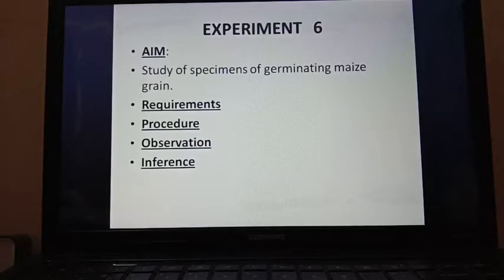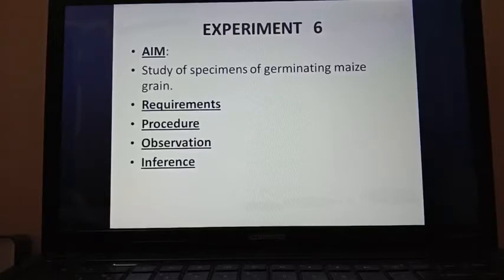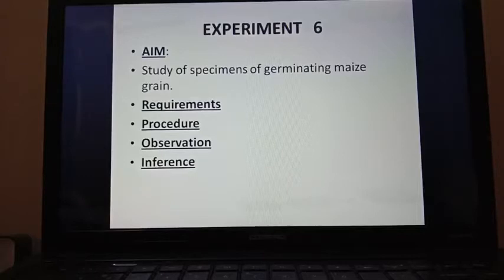First, to see the parts of maize grain, we have to soak some maize grains in water for about 24 hours. Then you can study the grain externally and also internally by cutting the grain into two equal halves through the vertical plane. Then you have to draw the diagram and note both the external features and the internal features.